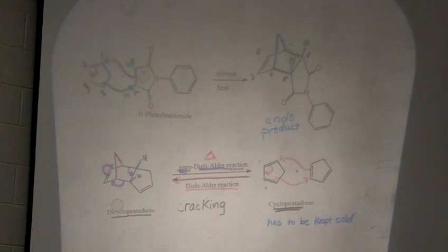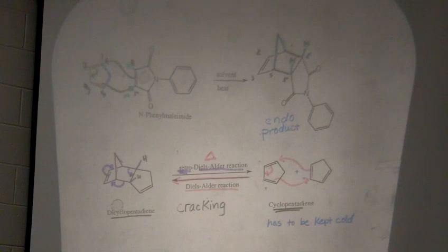It tells you in your lab manual, you need 0.6 milliliters, so we're going to deliver that cyclopentadiene to your reaction with a syringe, okay? Because even after it's been cracked, we've got to keep it cold on ice to keep it as cyclopentadiene before it reacts with your dienophile in your reaction, all right? So you will get your cyclopentadiene from your lab prof after it's been freshly cracked, okay?